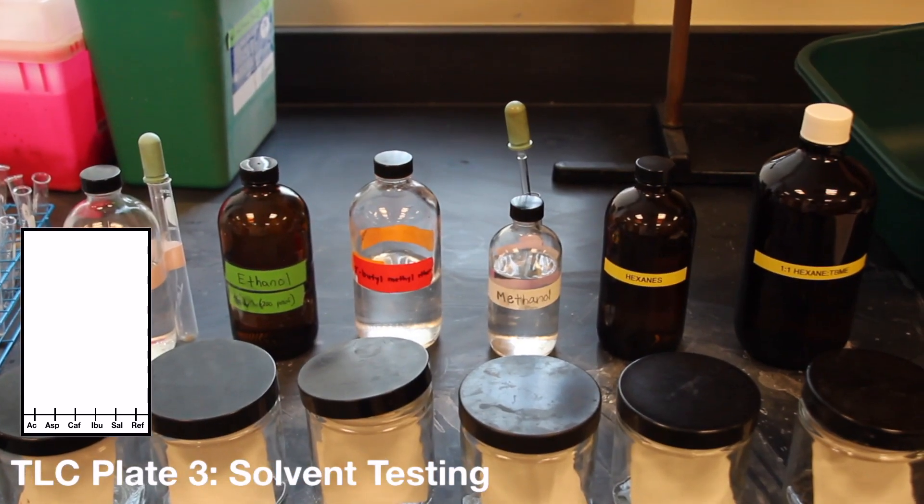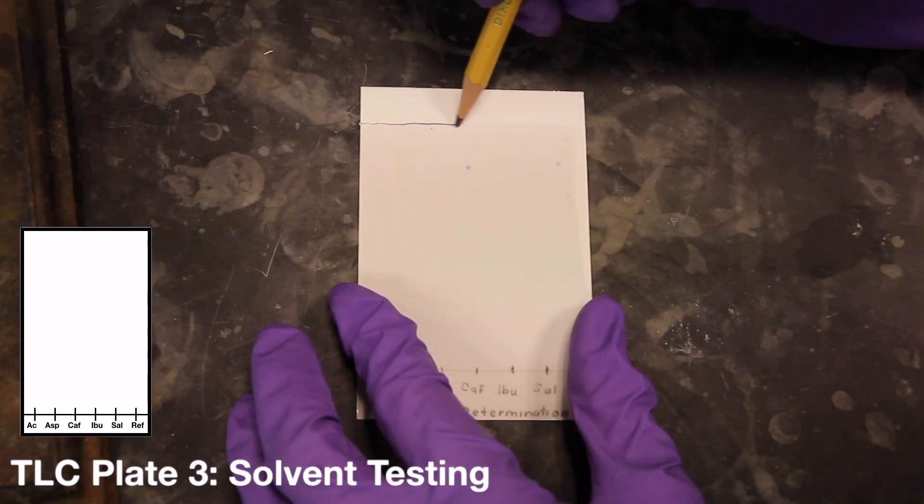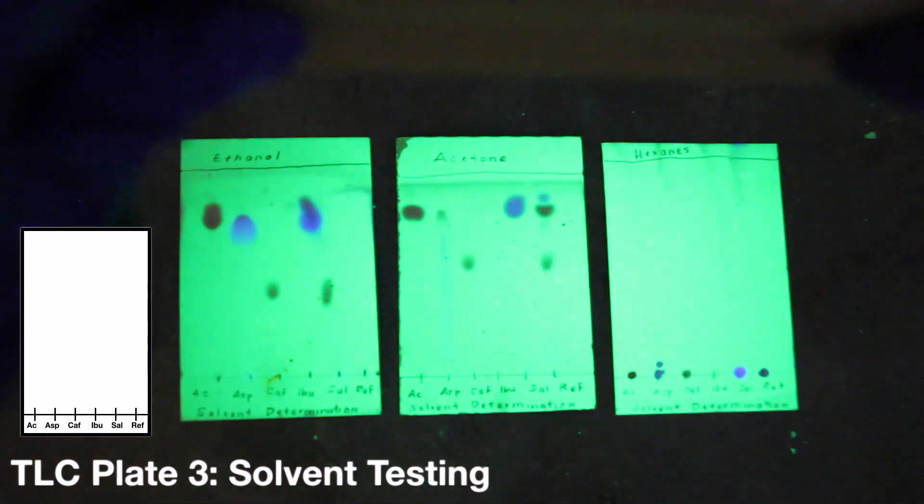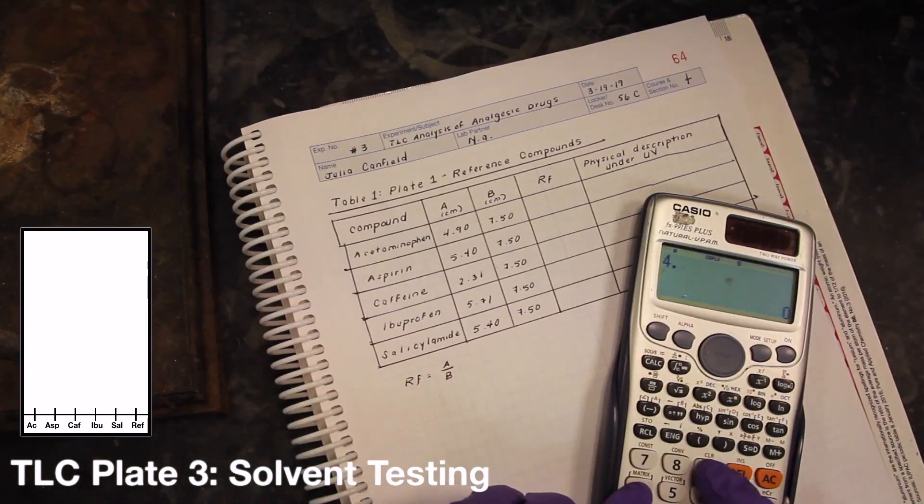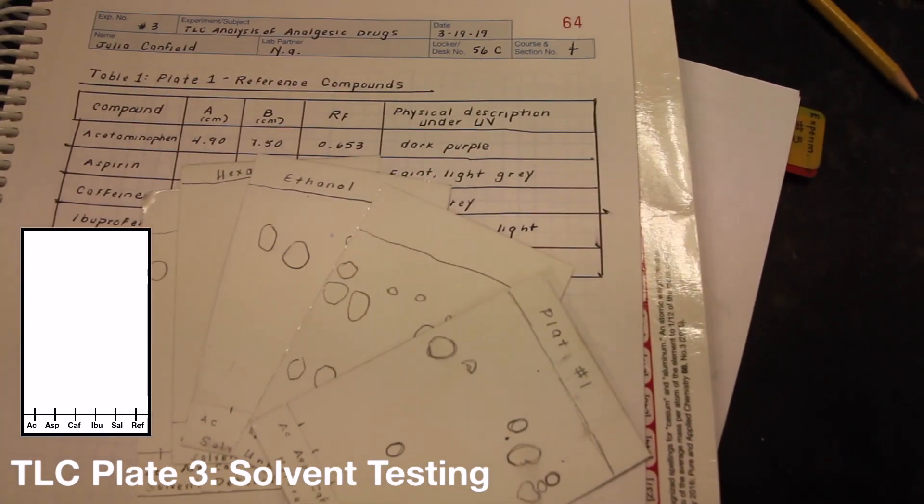After the TLC plate has developed, use the same procedure as before to visualize the spots and calculate the RF values of each. Alright, thank you.